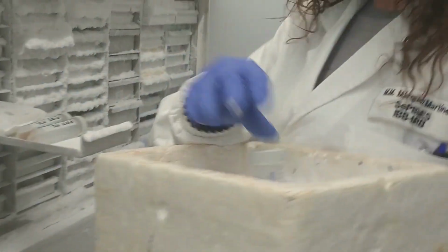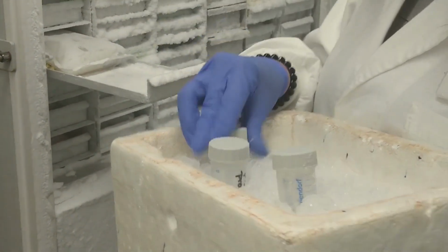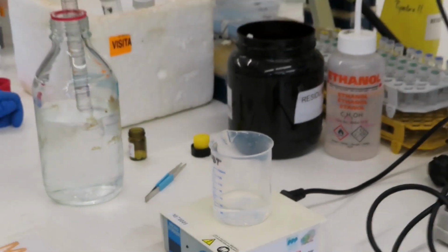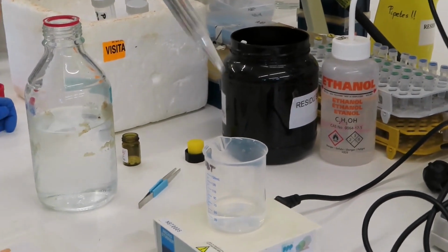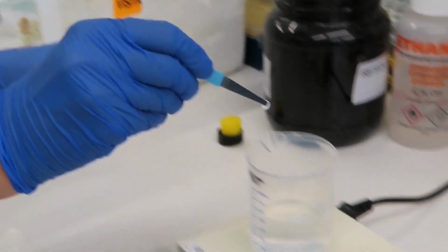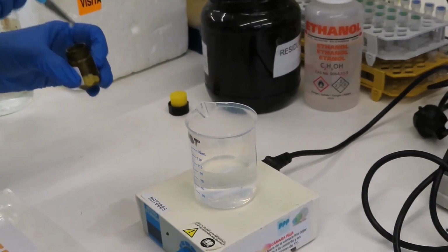The first step is to take the pellet kept at -80 °C and thaw it in ice. The pellet is resuspended in the appropriate lysis buffer suitable for protein stability and compatible with later purification methods. It's very important to add protease inhibitors to the lysis buffer to avoid the digestion of the protein to be purified. In this case, we are adding some tablets from a commercial EDTA-free protease inhibitor cocktail.